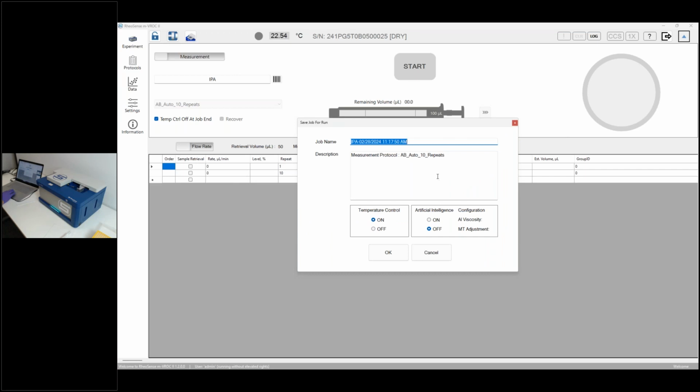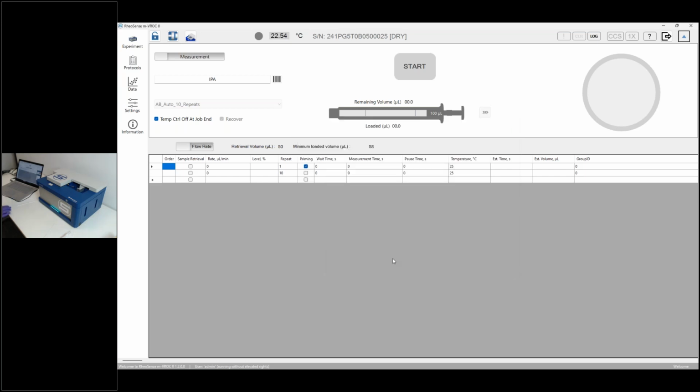One of the things that we also do is we make sure that the testing parameters or environment are optimized. And so what we have is what we call a pre-diagnostic run. That will check the health of the chip as well as look for leaks that could be in the system. So we'll see that now.